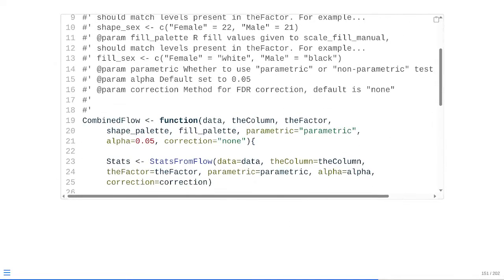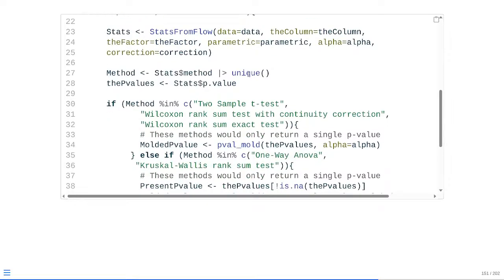So when we're actually applying this within a context or a plot, we can remember we're dealing with different types of tests being run. So I'm just retrieving the methods from our corresponding output. And then these methods are structured in characters that are very similar to each other. So we can see that if the condition is a 2-sample t-test or a Wilcoxon rank sum test or whatever variation of it, it's only going to be a single row.